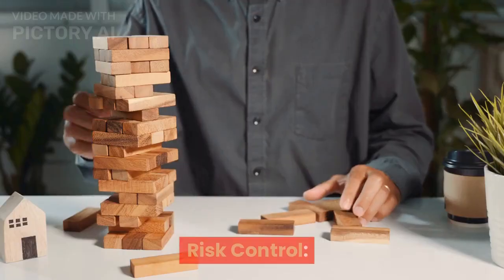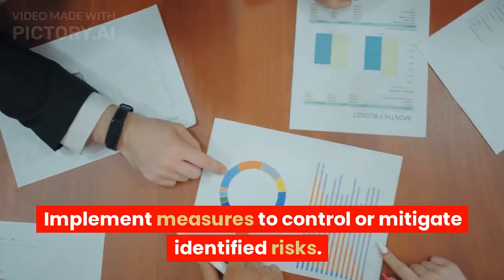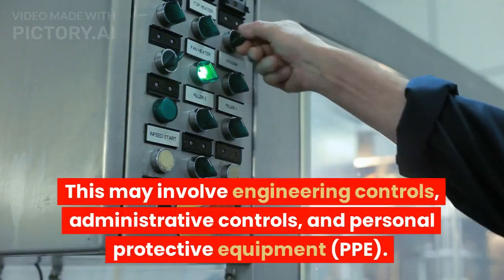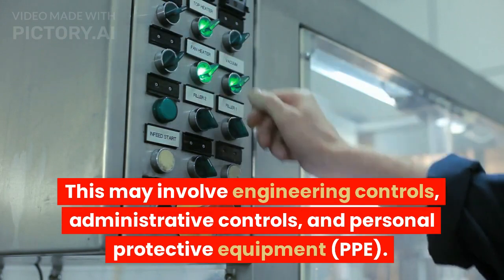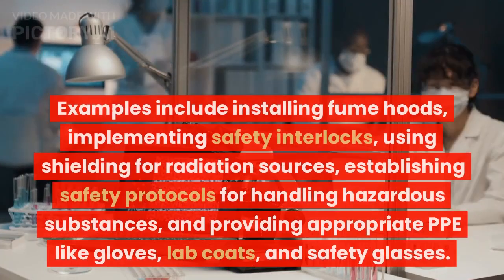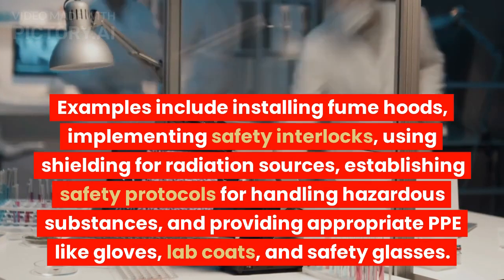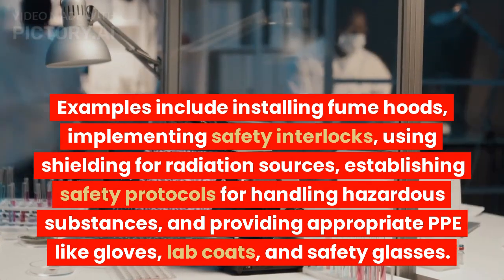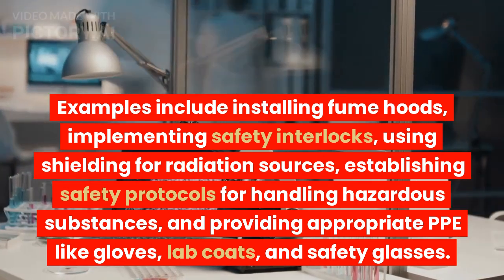3. Risk control. Implement measures to control or mitigate identified risks. This may involve engineering controls, administrative controls, and personal protective equipment (PPE). Examples include installing fume hoods, implementing safety interlocks, using shielding for radiation sources, establishing safety protocols for handling hazardous substances, and providing appropriate PPE like gloves, lab coats, and safety glasses.